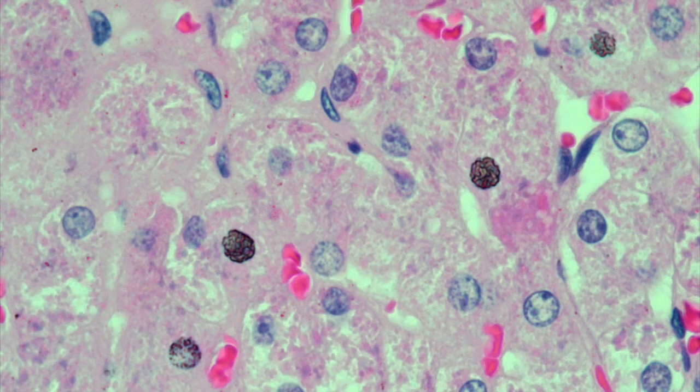So this just re-emphasizes the concept of bringing those slides promptly out of the xylene, removing just a little bit of the xylene, but you don't want to overdo it, so you don't want them sitting in a rack becoming completely dry before you move to the next step. It really is important to retain a layer of xylene on the surface of the tissue.